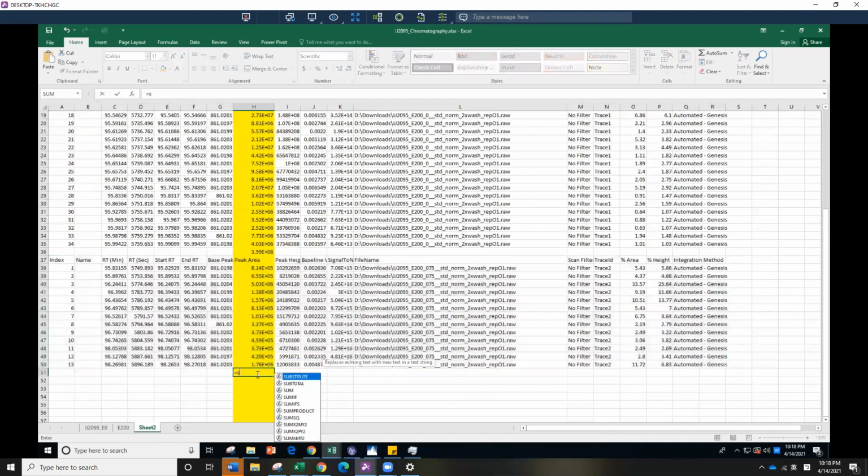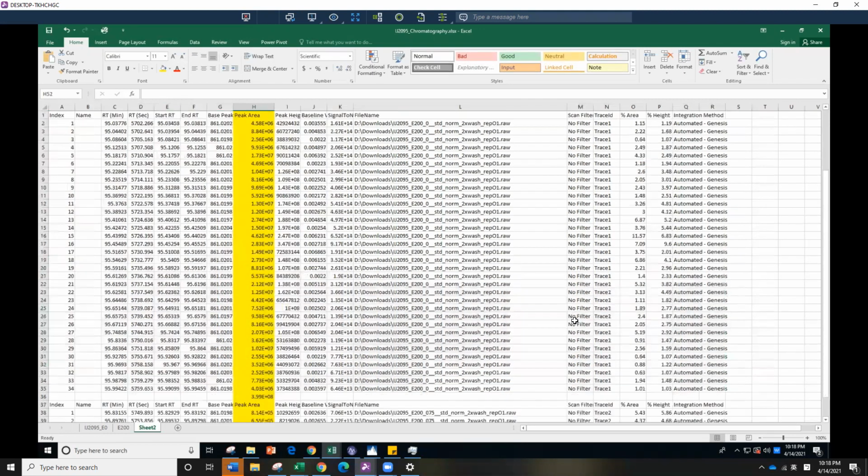And then again, sum them up, and then you're going to create another table across that cell, from 0, 0.75, 1.5, 2.25, for that is for E light.